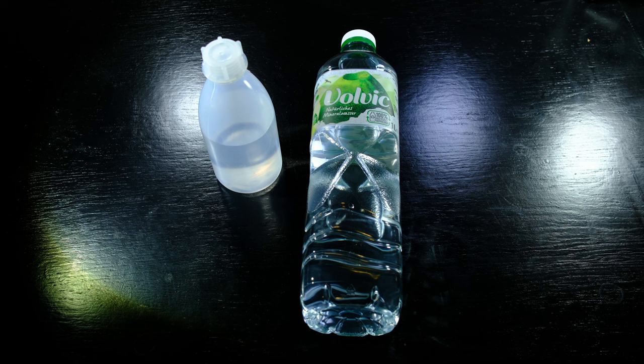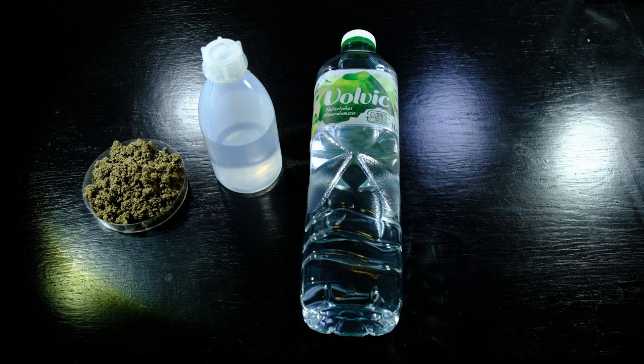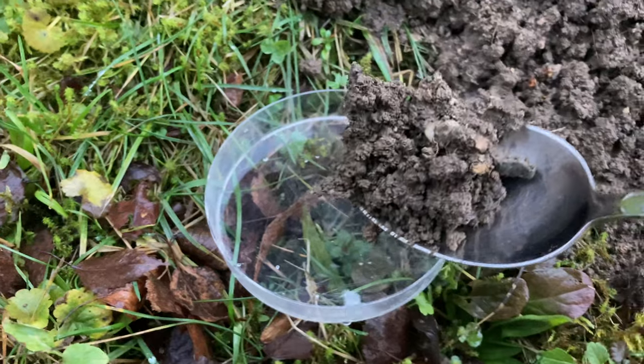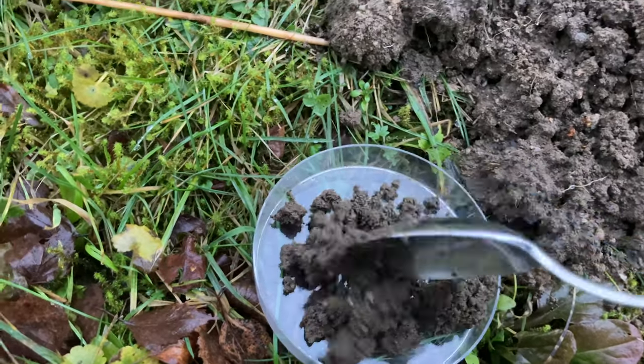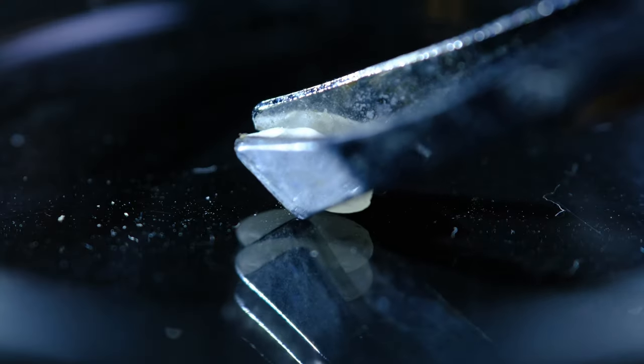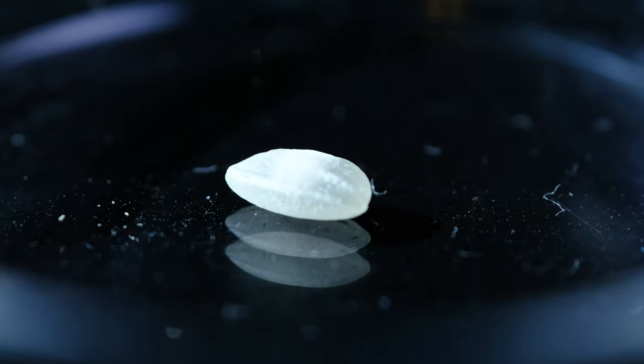Then we need some pure distilled water, some soil from a garden or forest. It is important that the soil is free from pesticides and fertilizers. Mole mounds are an excellent source of material. The soil can also be dried and doesn't need to be super fresh. Then we need a kernel of rice. This will be part of the nutrients for the amoebas and will be placed directly into the culture vessel.